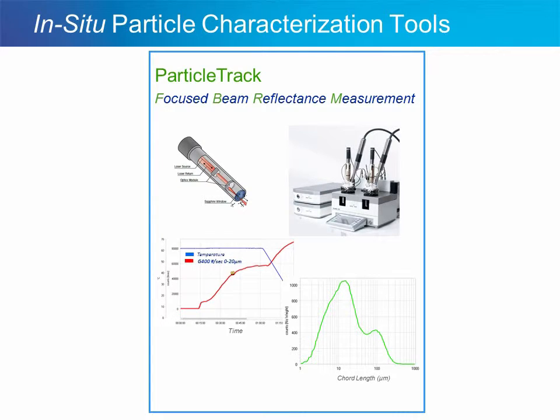It's also a probe-based technique, so sampling isn't required, so you avoid this sampling issue. We actually make the measurement directly in the process itself, and essentially for flocculating systems, it can be a very useful tool to track changes and understand what's happening in there.